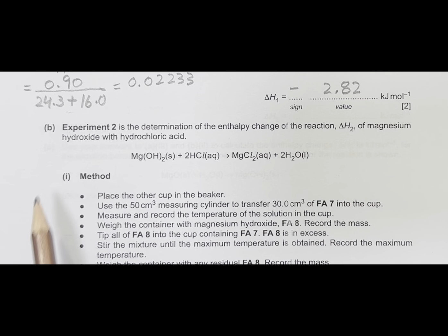Now let's move on to the next part. B says experiment 2 is the determination of enthalpy change of the reaction, that is delta H2, of magnesium hydroxide with hydrochloric acid according to the equation. Method: place the cup in the beaker. Use a 50 centimeter cube measuring cylinder to transfer 30 centimeter cube of Fa7 into the cup. Measure and record the temperature of the solution in the cup.